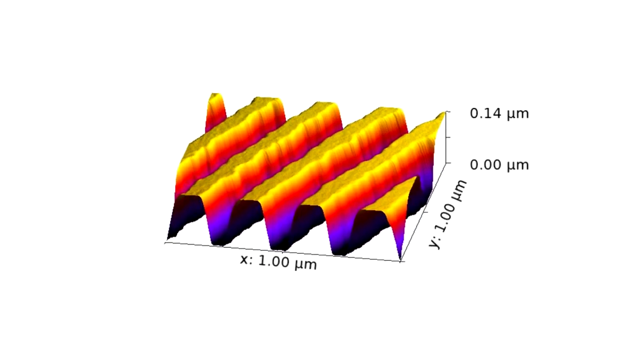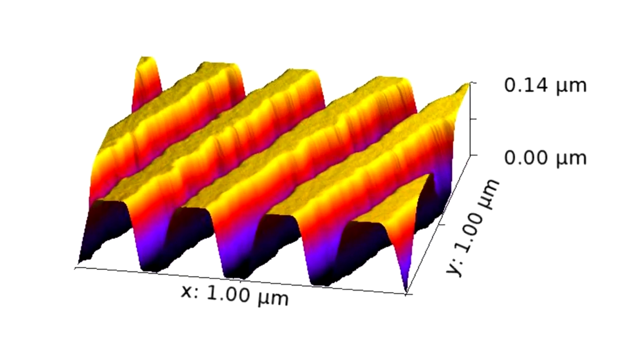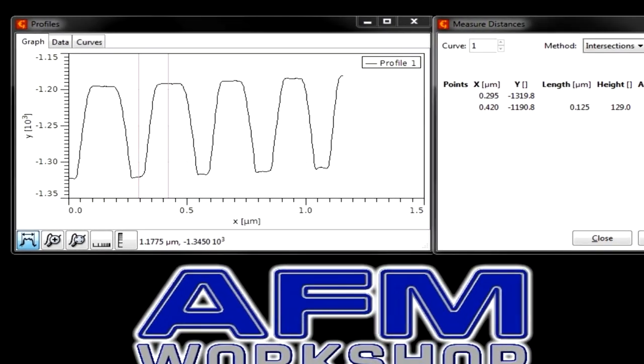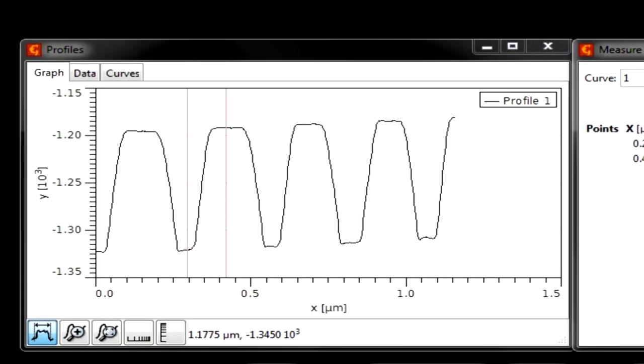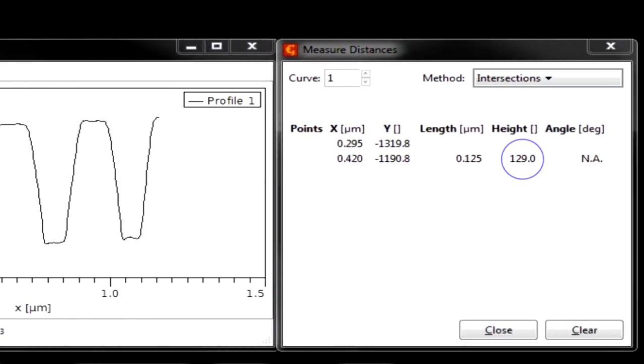A common industrial application for the TT2 AFM is measuring the dimensions of gratings. We are able to easily measure the height as well as the pitch as shown here.